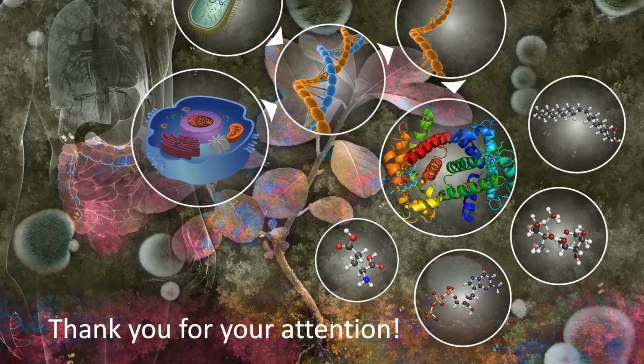So I have a question along the lines of the sample prep. Is this on intact soil, or is there kind of a pre-separation of the microbes? So when I said indirect, it can be either. We can do a pre-separation of the microbes, which is the indirect method, which actually for Hopland seems to work really well. And you can kind of wash the microbes off the soil. The problem is you're going to bias toward those microbes that easily come off, and not the ones that are tightly bound.